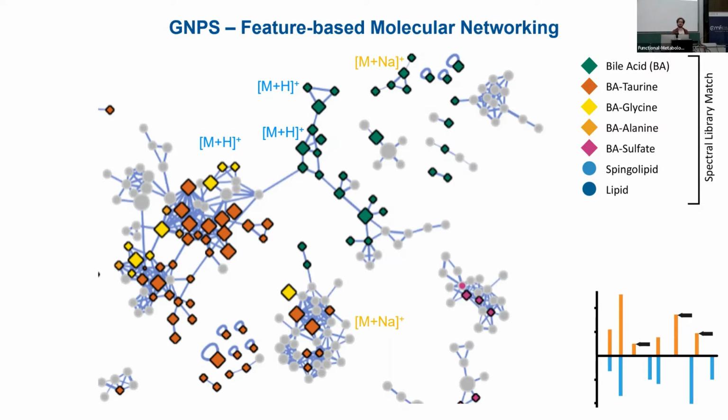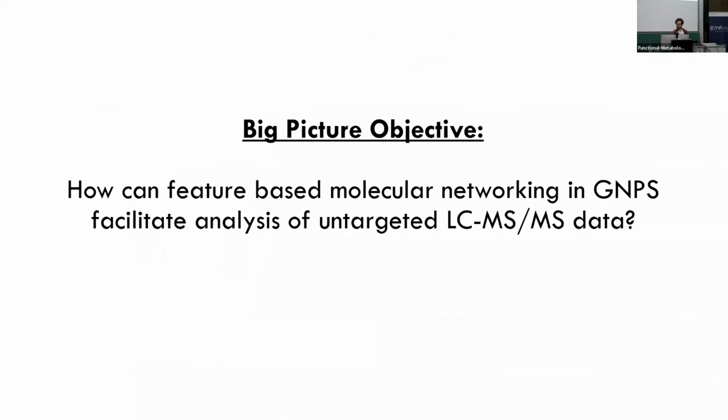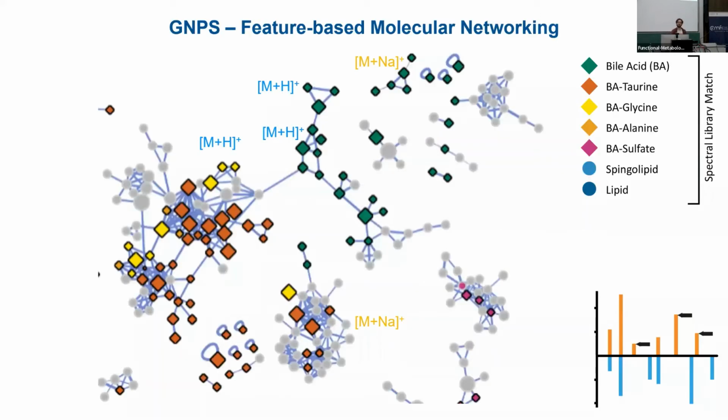And most of the things are going to work with this. So this is very important to understand, the concept of this network. And Danny's also going to show you how to make the most out of your network. There's not going to be one visualization that is maybe satisfying you in all needs. You always have to find the best way to convey the message that's in the networks. And it sometimes gets very complex.